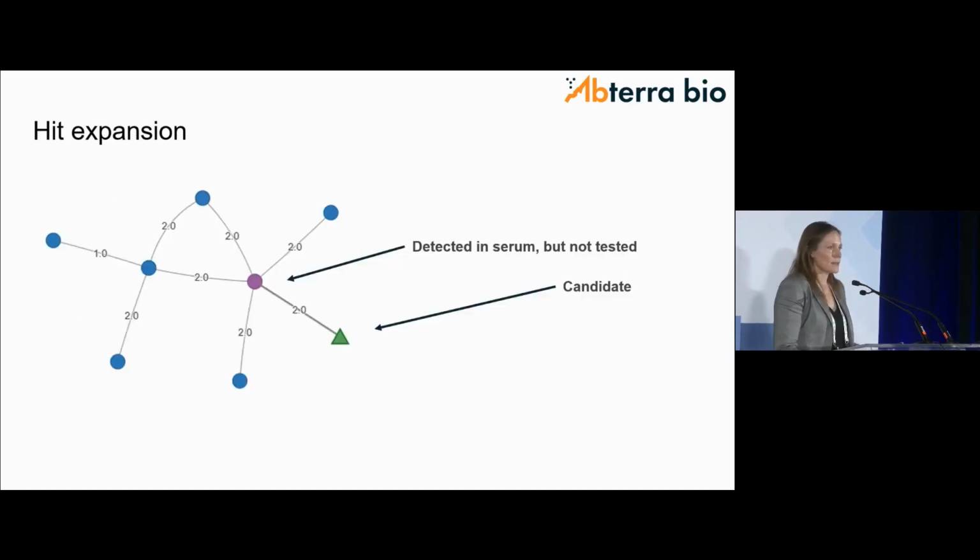So we took that same candidate, we did that zoomed out clustering just on sequence level. In this case, we took all CDR3s, we clustered on 80% identity in the same germline V gene to get clone clusters. And we found kind of a cluster of 7 other CDR3s that we could then mine for other candidates that had similar specificity, but hopefully other properties from our candidate.